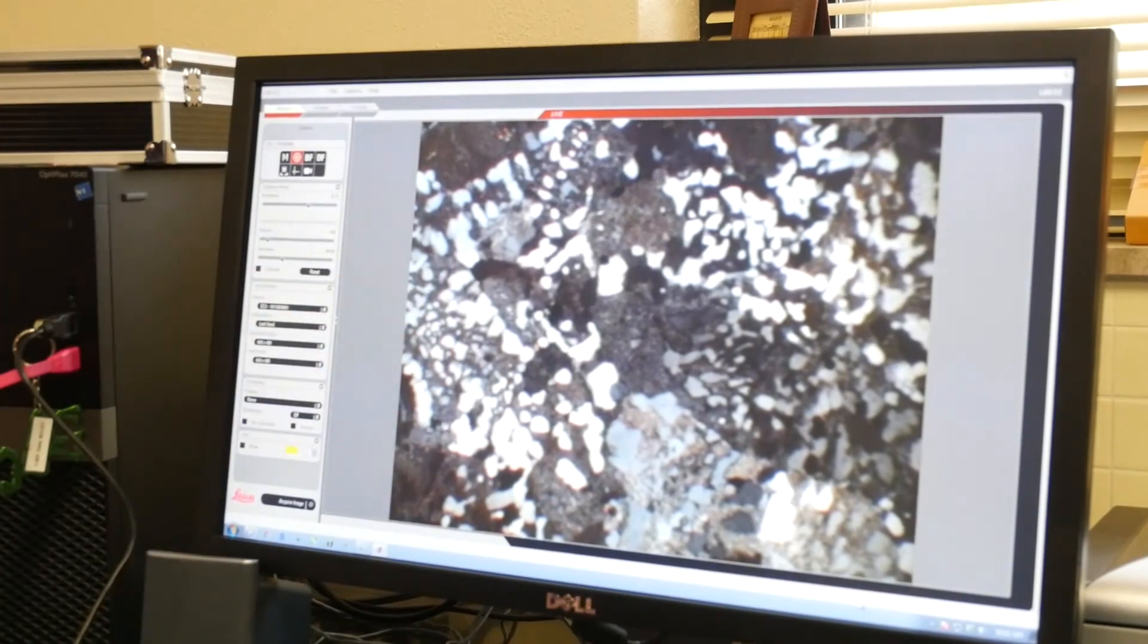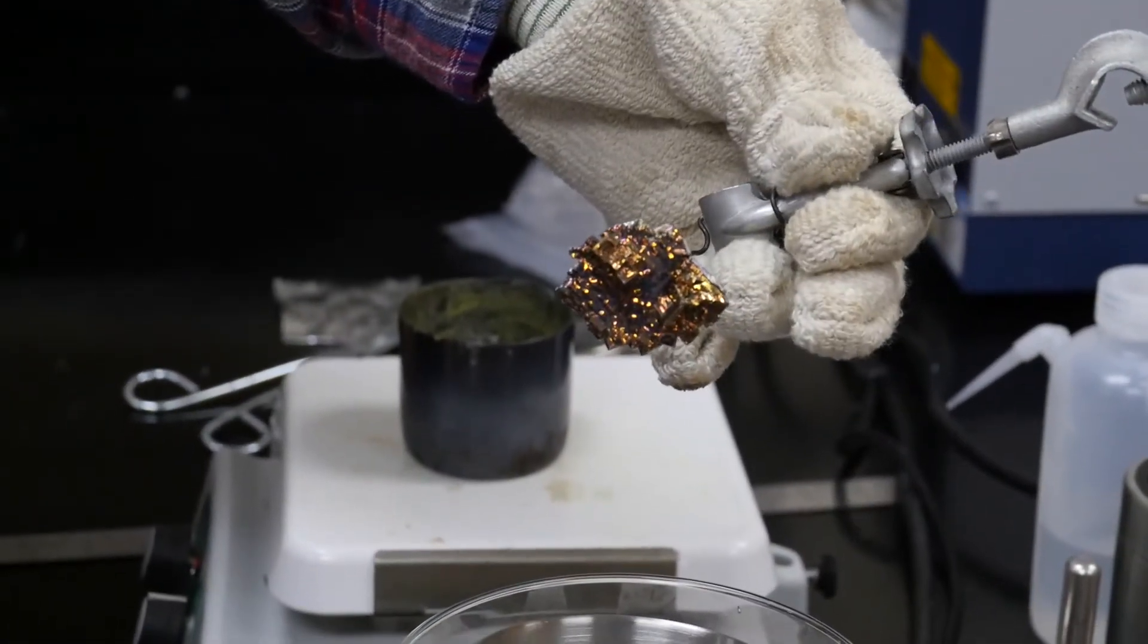And you can actually sit here and as you're watching it, it's starting to change color.